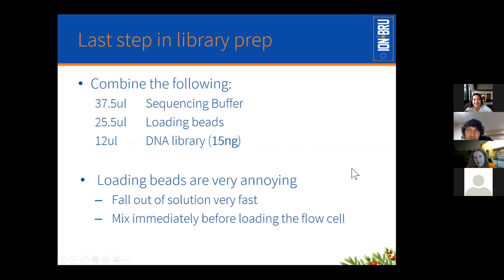While it's sitting for 5 minutes, you can do the very last step in the library prep, which is just adding some buffer and loading beads to your library. The loading beads are extremely annoying. They do not stay in solution. They will fall out of solution in front of your eyes. Even in the pipette tip, you can watch them fall out of solution. So when you add them, don't bother to mix them until immediately before you're going to put the library on the flow cell, because all that's going to do is give more opportunity for you to shear your DNA. You may as well just wait until you're about to put it on the flow cell.